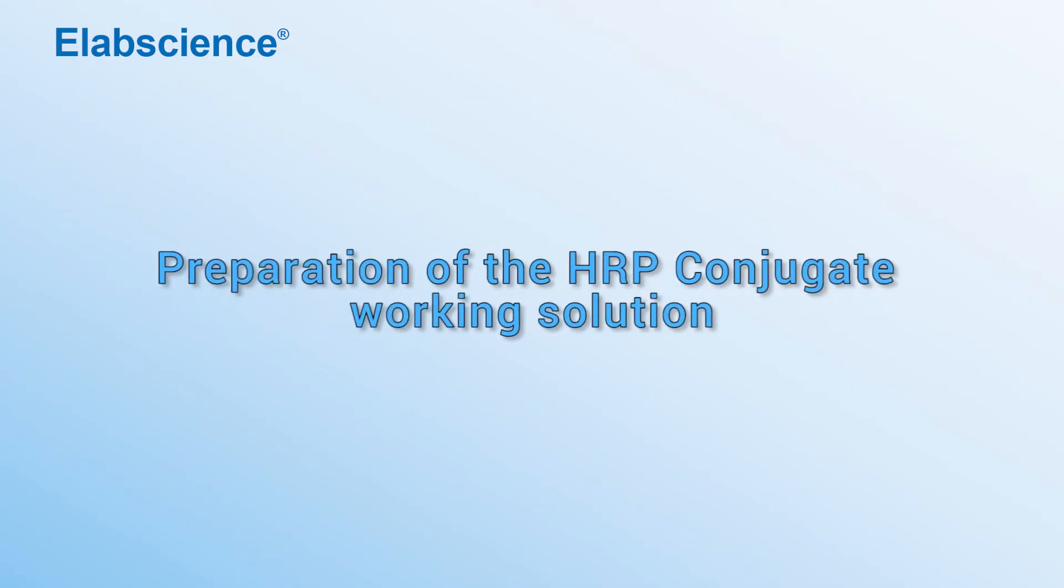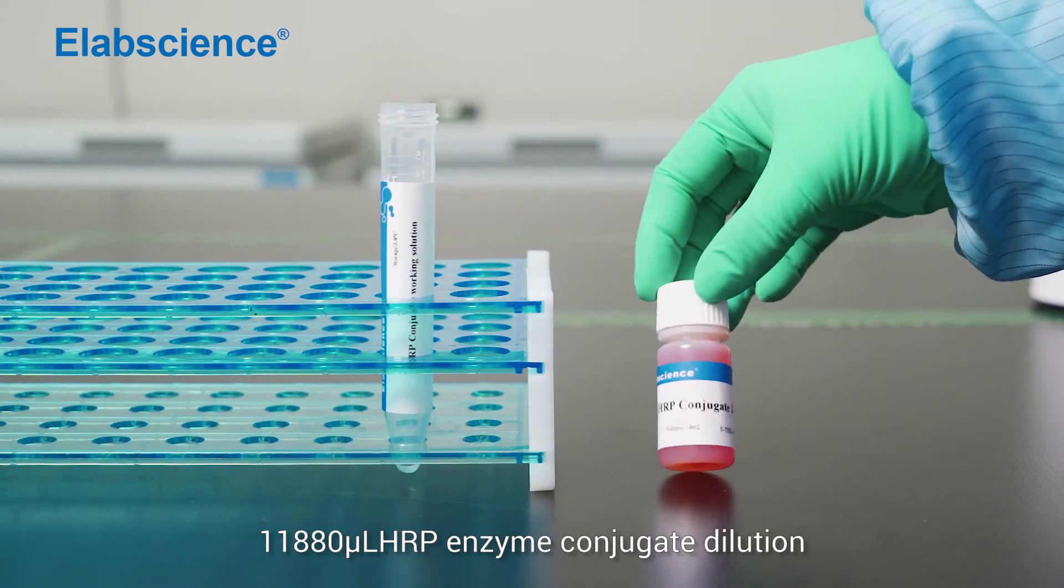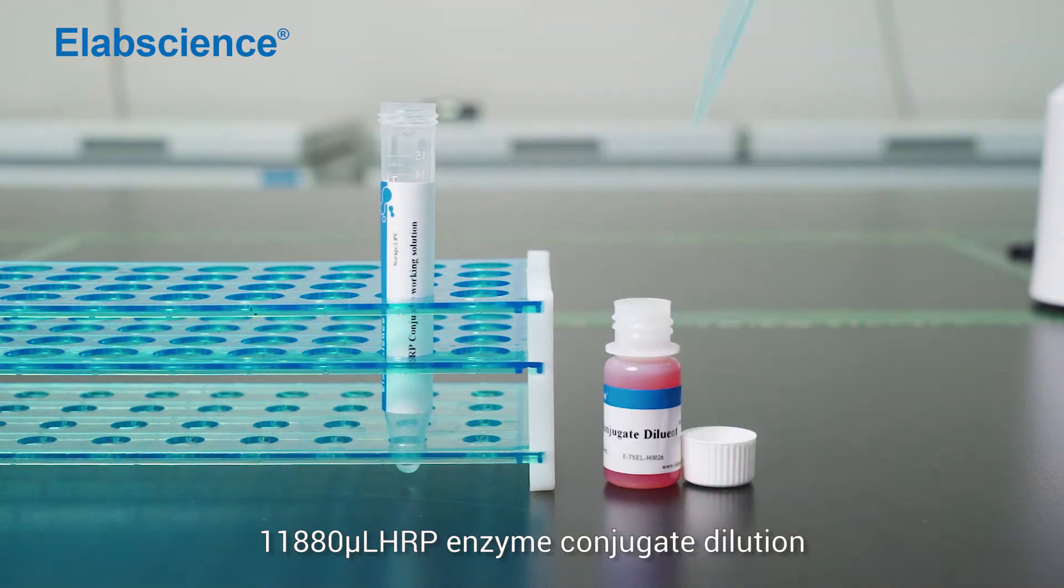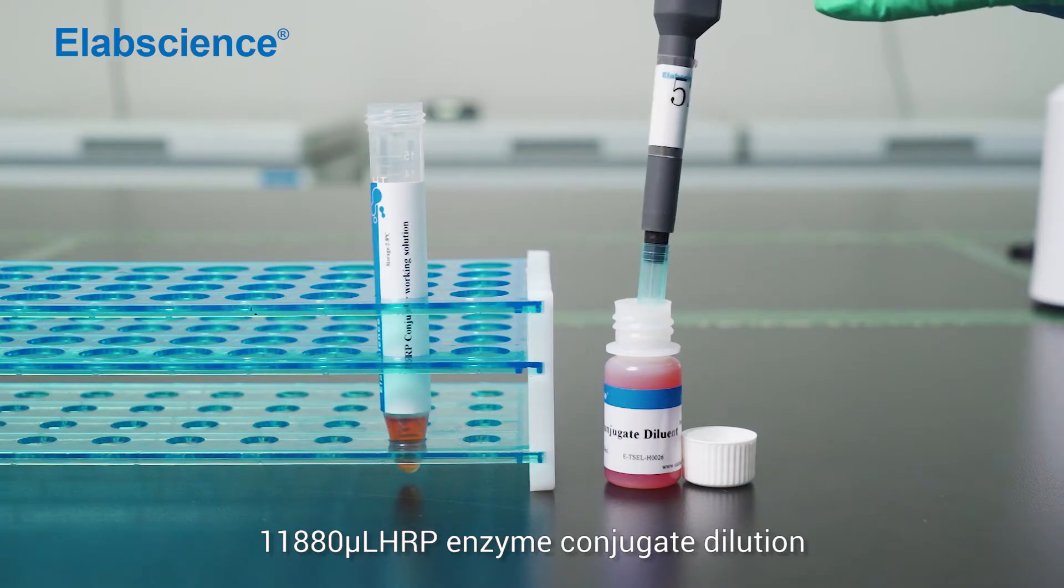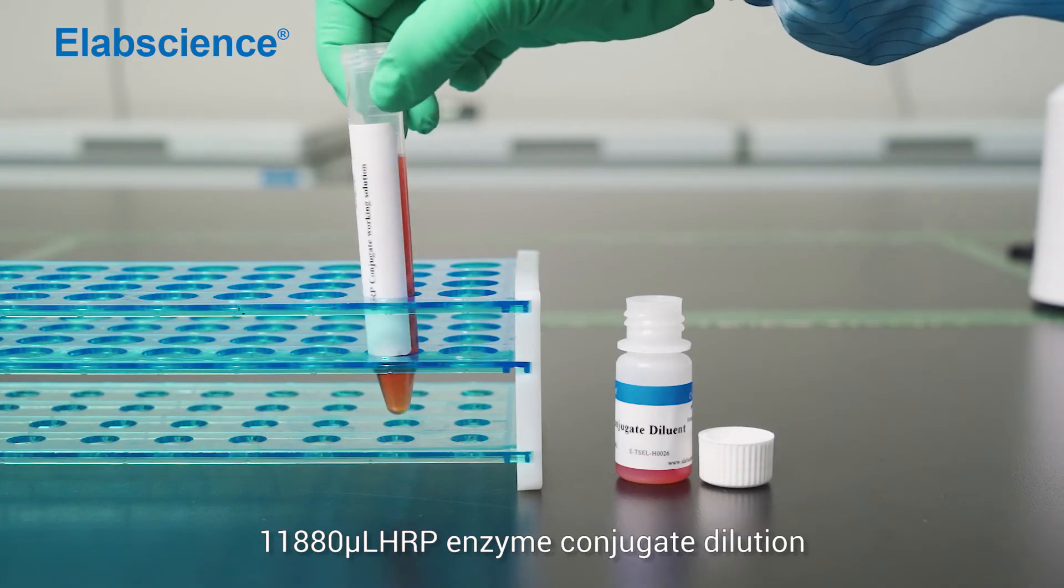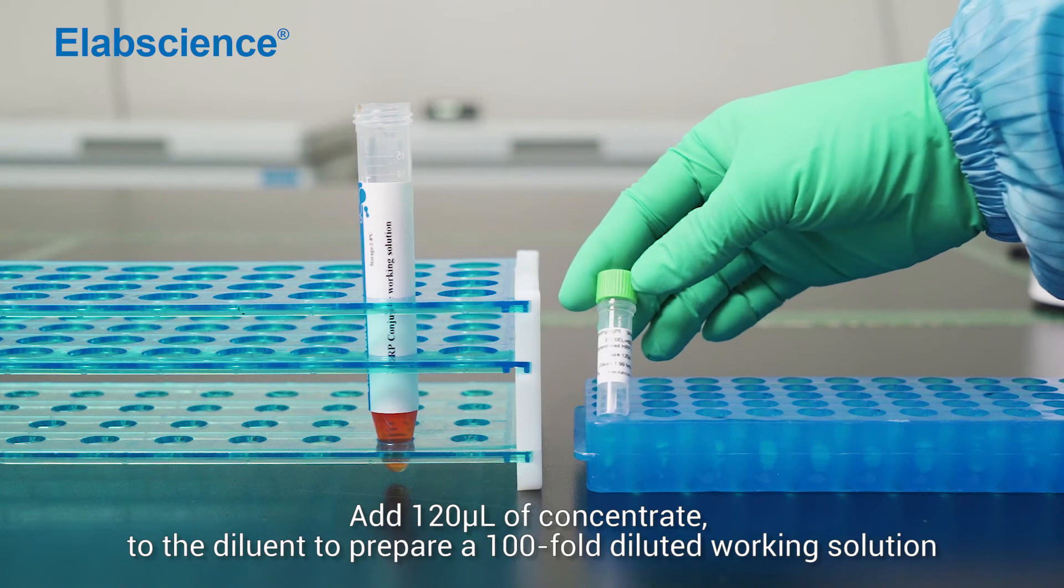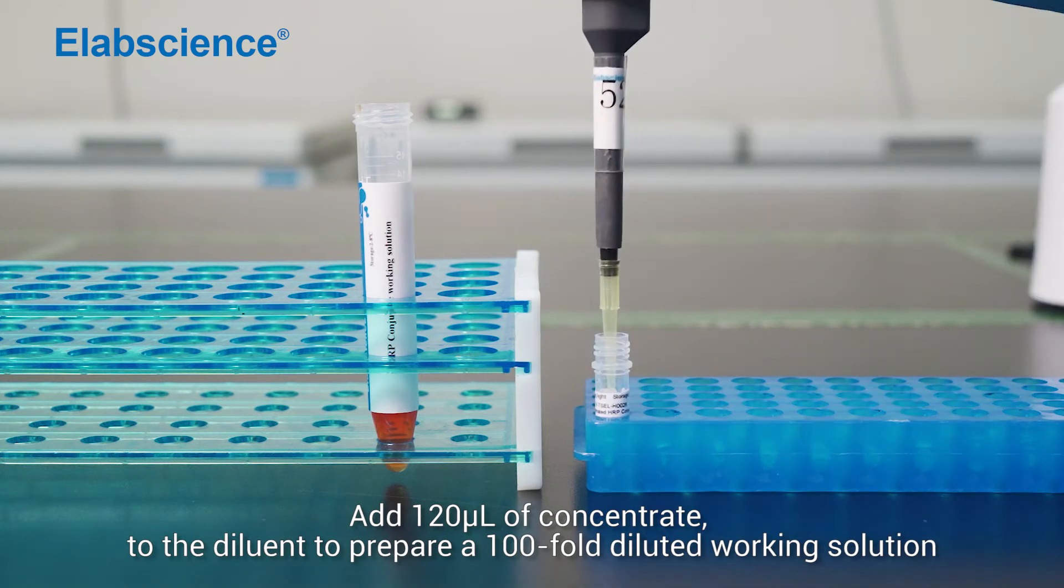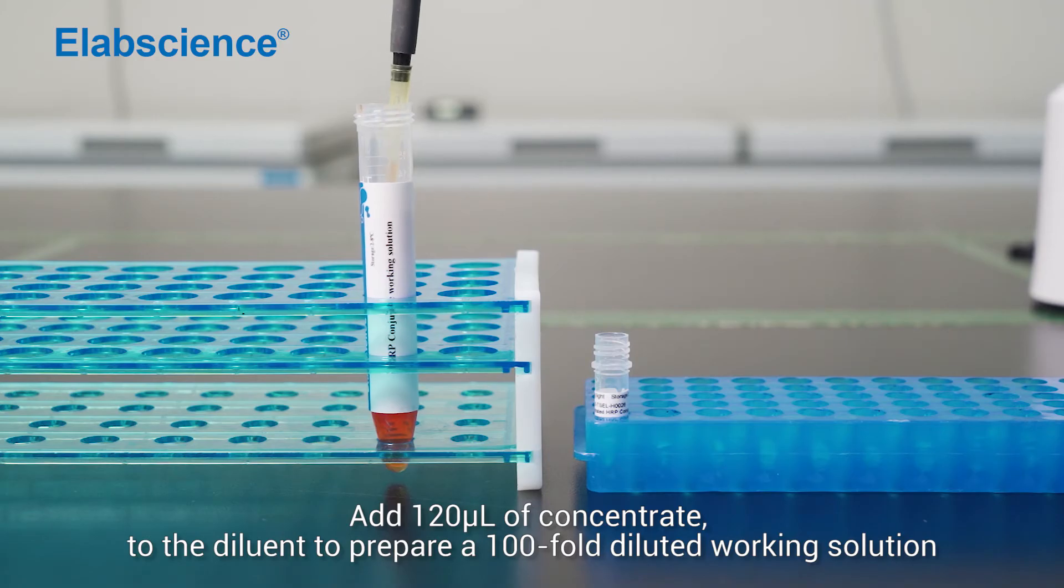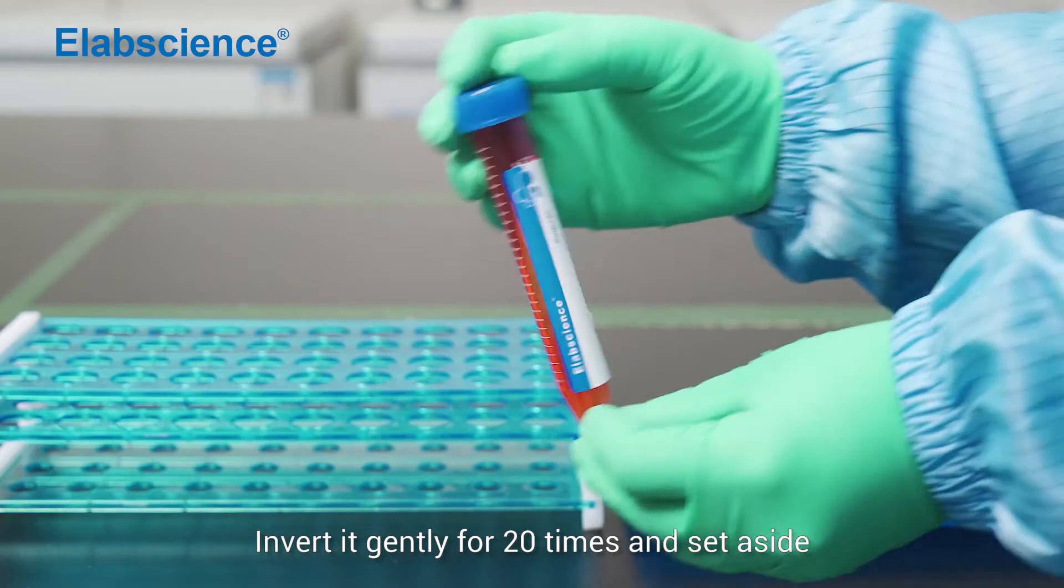Preparation of the HRP conjugate working solution. Take 11,880 µL of HRP enzyme conjugate diluent. Add 120 µL of concentrated to the diluent to prepare a 100-fold diluted working solution. Invert it gently for 20 times and set aside.